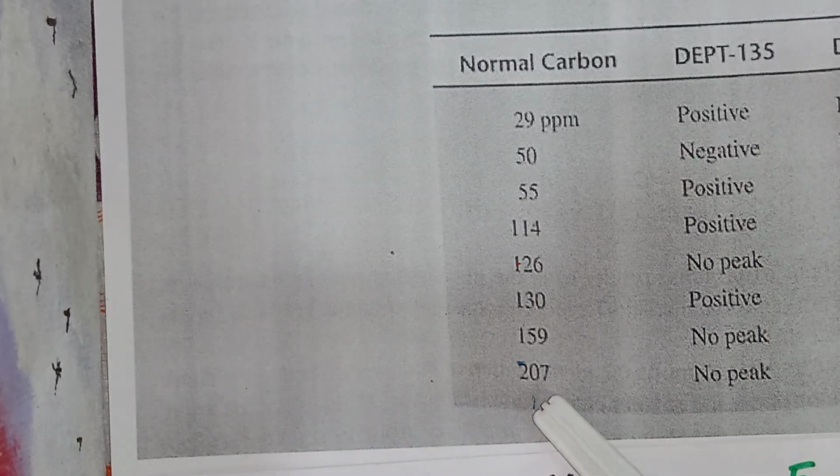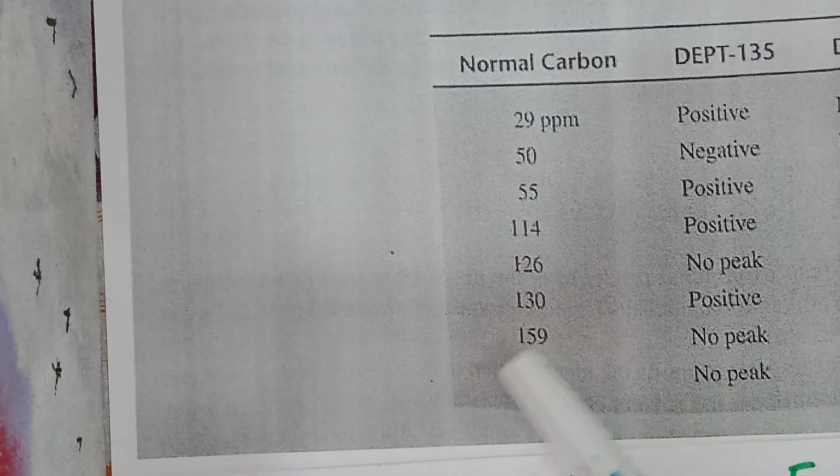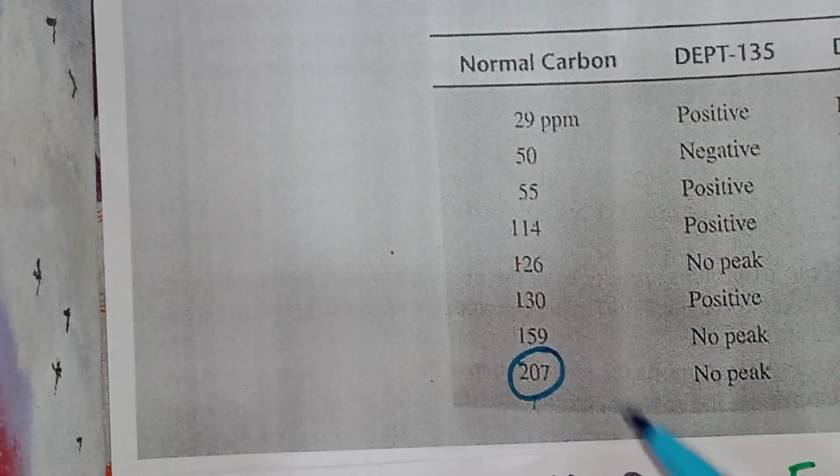The same here, carbon NMR confirms the presence of a ketone. This peak at 207 is indicative of a typical ketone.